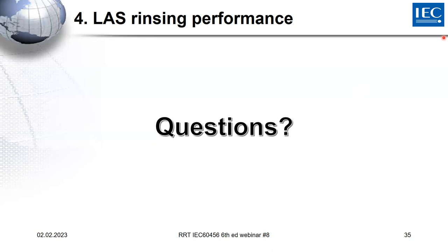I'm not sure if this is. Yeah, in the European version, we have it in. There's a quality check of materials, and yes, if it's covered completely in the IC, it should be in. But I don't know exactly at the moment. Yes, Markus, that's right. In the EN version, it's inside. It's called cuvette matching. But I'm also not sure whether it is inside in the IC. The order is a little bit different here. There is a quartz cuvette and glassware cleaning and handling in general cleaning, periodic glass cleaning. I can check it. If not, it might be an idea to take it up. Thank you.